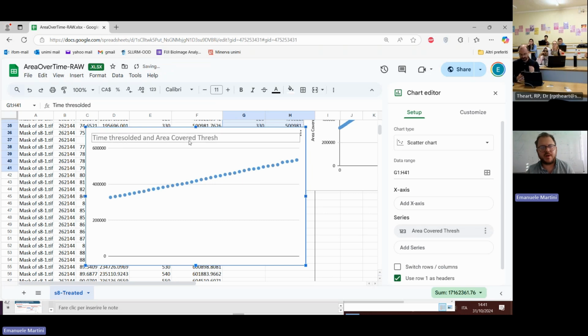Okay, you should reach a point like this, with only this one. And now it's okay, no? Now it's fine because we have reached it. We removed the plateau area, the knee area, and we only have the linear behavior we expected.